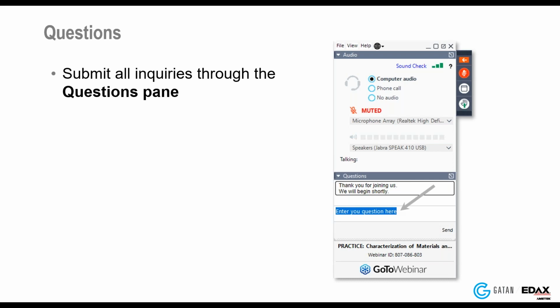Okay, the next question is: the EDS and backscattered electron signals originate from different volumes within the sample. How do you ensure that they're sampling the same region of the sample? That's an important question, and something I didn't really speak to in this webinar today.